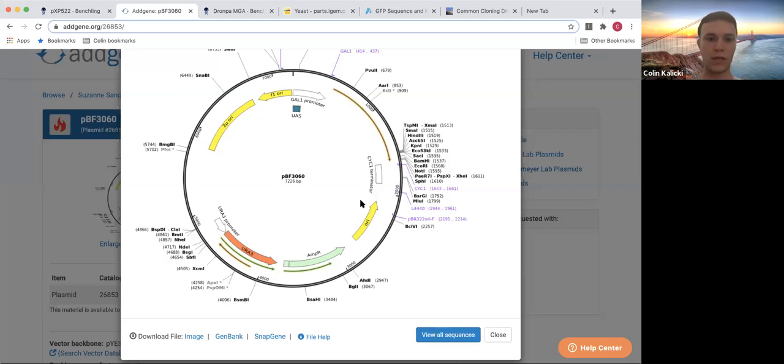So my question for you is, why do we have 2 origin points? If this is meant for yeast, why not just have 1 origin point? If you've got answers for that one, I'll now be looking at you.